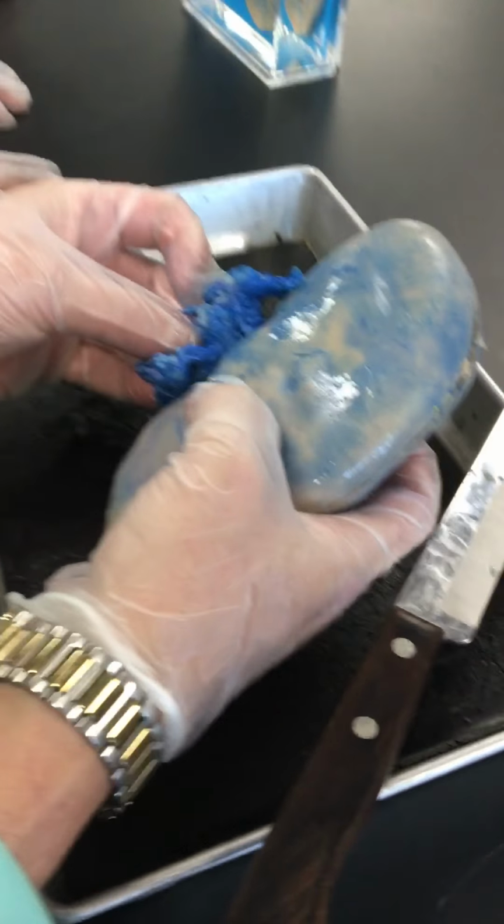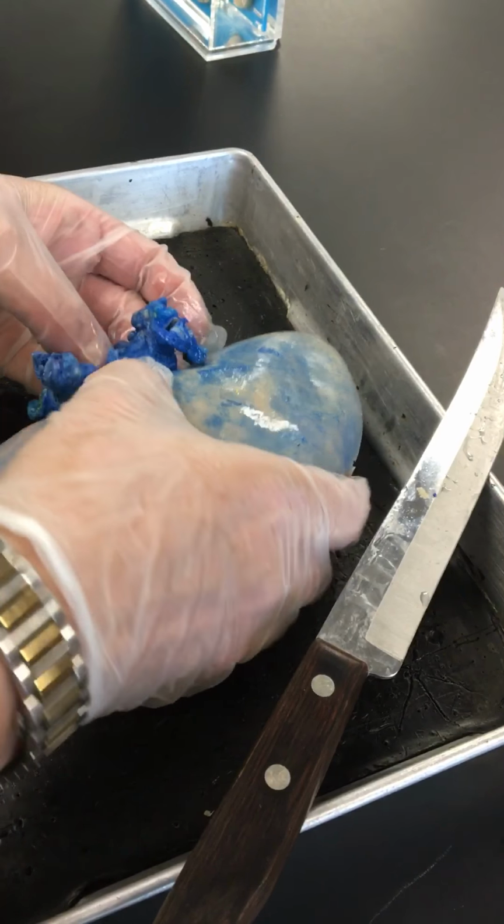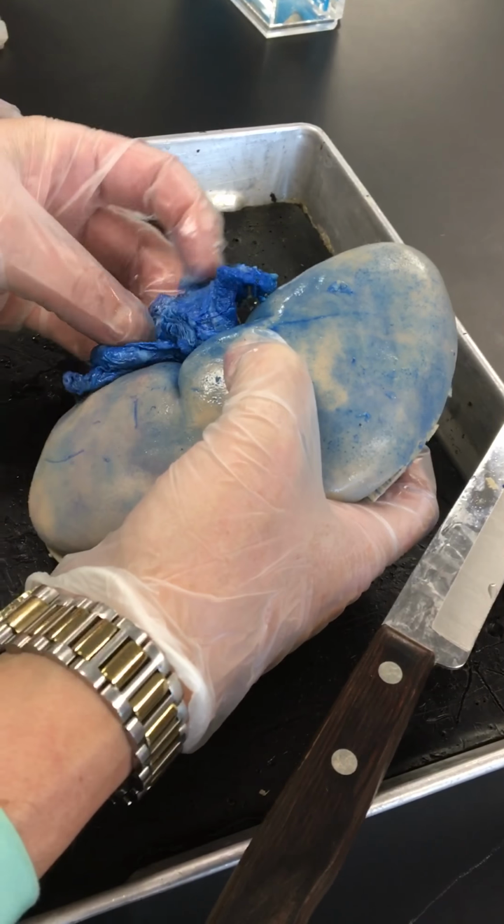It's like it's completely missing. No, it's there. It's just obliterated in blue. But come practical time, I will choose one that is a lot more clear than this one.